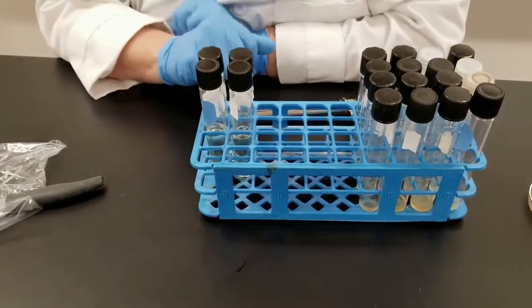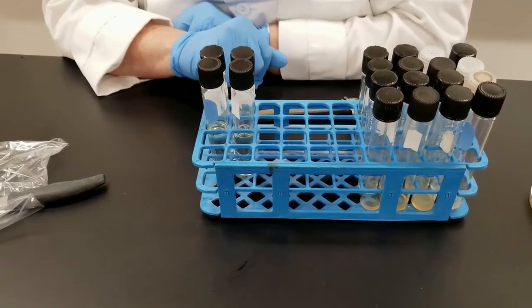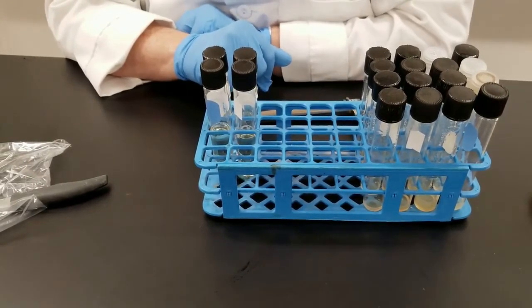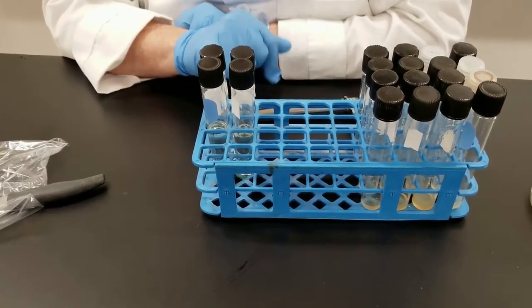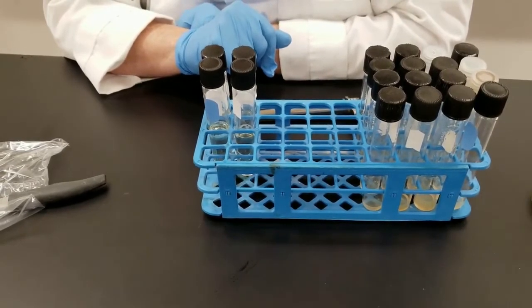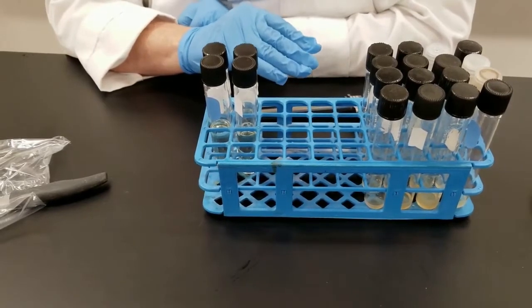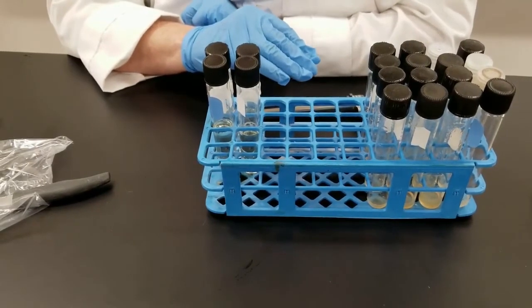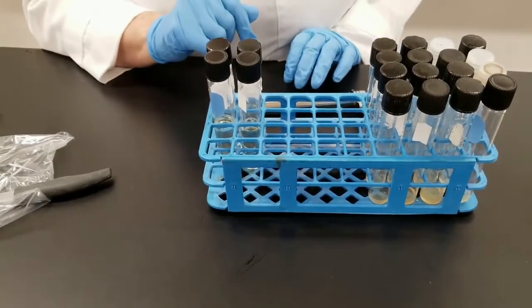To grow fungi, sometimes you have to do a couple of things differently than what you would with bacteria. Number one, fungi prefer a more acidic environment, and so we often drop the pH down a bit. Media that we grow bacteria in is usually anywhere from pH 7, which is neutral, to pH 7.5, maybe up to 8, and bacteria prefer that, but fungi don't.